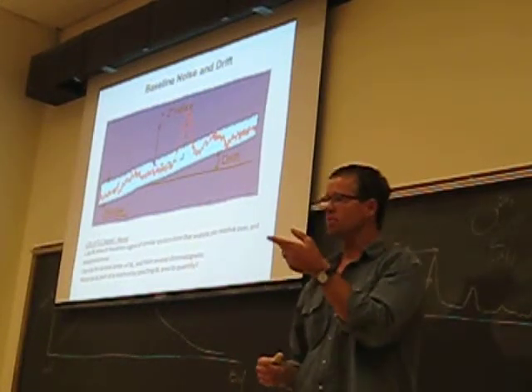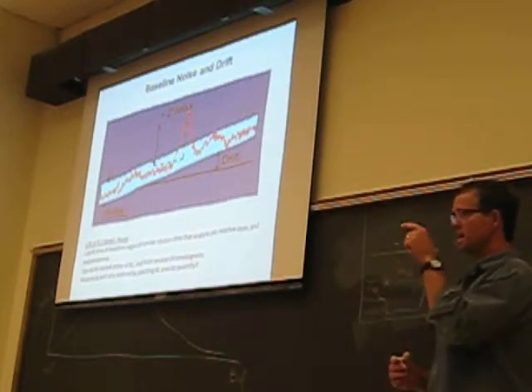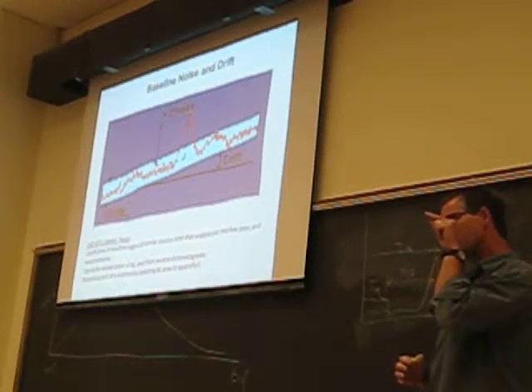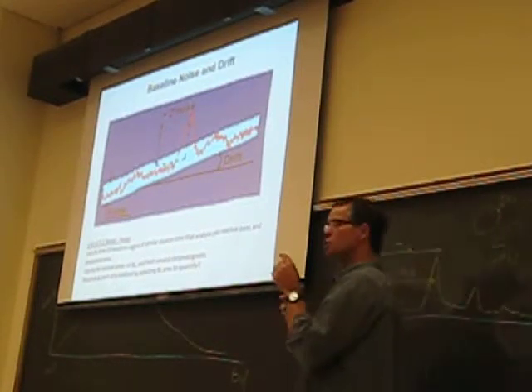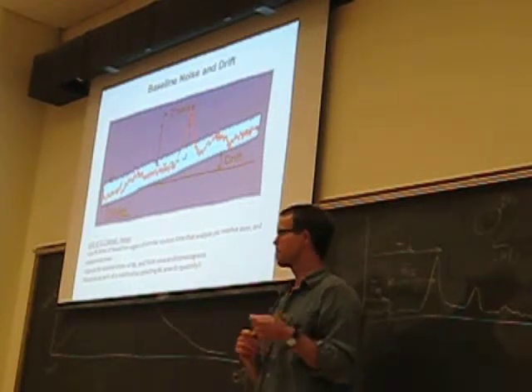And so we went through the UV-Vis spectrometry experiment where you measured blanks 3 times and saw what that absorbance was 3 times. And if that absorbance was varying just a small amount between when you hit read a bunch of times, it was varying due to electronic noise coming from the detector of the instrument. Okay?